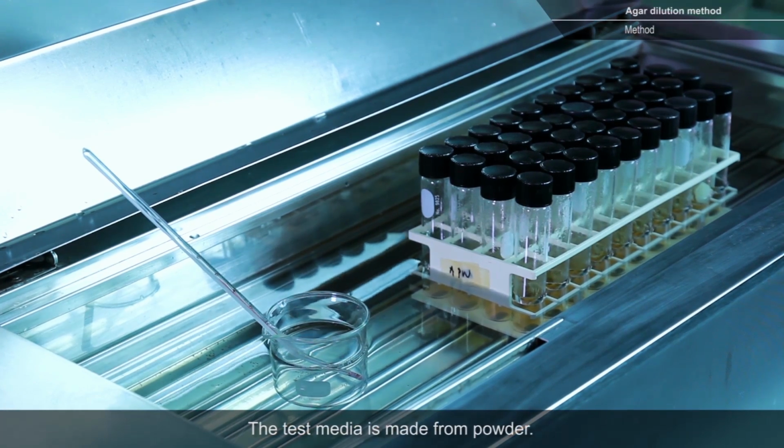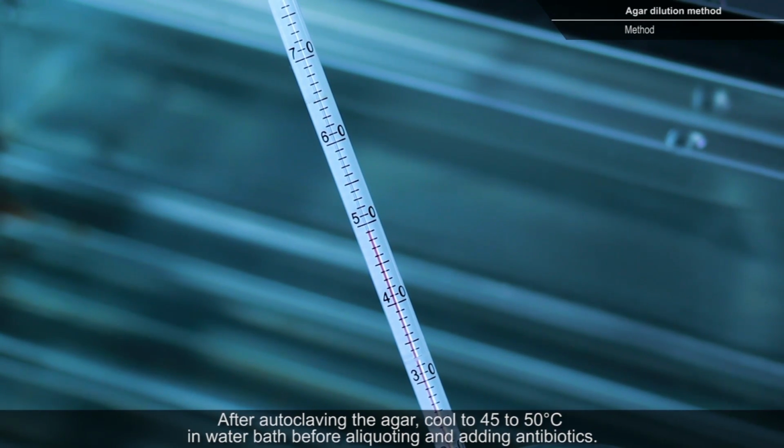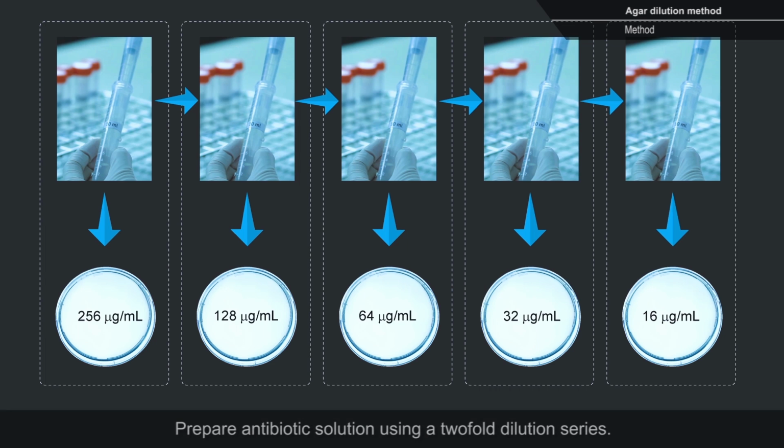The test media is made from powder. After autoclaving the agar, cool to 45 to 50 degrees Celsius in a water bath before aliquoting and adding antibiotics. Prepare antibiotic solution using a 2-fold dilution series.